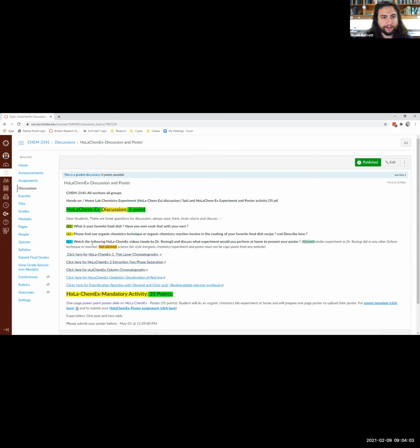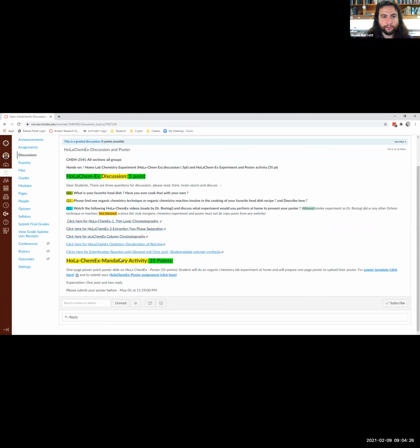And then question 3, finally, watch the videos that are listed here. You'll have video 1, TLC, extraction 2 phase separation, column, oxidation, decoloration of red dye, and the esterification reaction with glycerol and citric acid. A lot of these are performable at home, but the main thing that he wants you to do is to review these so that you can go forward and create your own PowerPoint poster slide. So let me stop sharing so I can open this up for you.